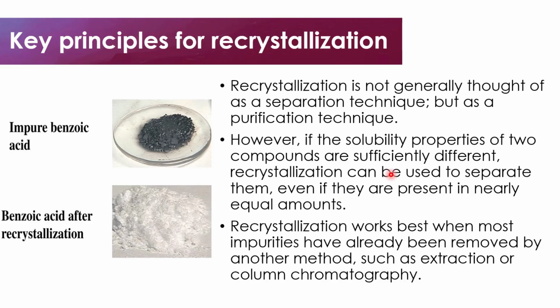So this is the only condition under which recrystallization can be used to separate two compounds. Also, recrystallization works best when most impurities have already been removed by another method, such as extraction or column chromatography.